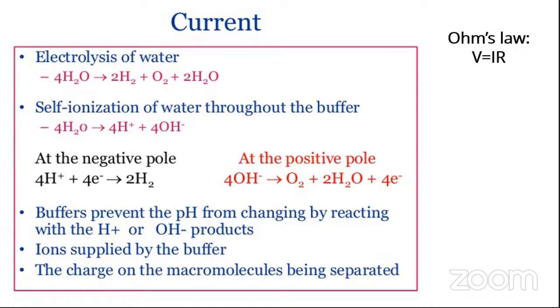So now that depends upon certain aspects. Yes, Sarvesh wants to say something. He has written resistance, but yes, a frictional force which is acting against the mobility of every charged entity under the effect of the electric field will be essentially responsible for resistance. So, do you believe this now? That if I increase the voltage, there will be an increase in resistance or a decrease in resistance?